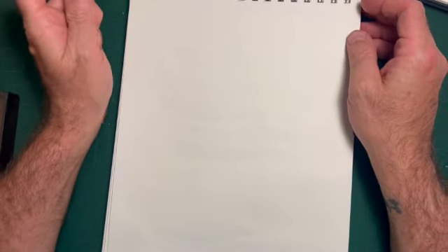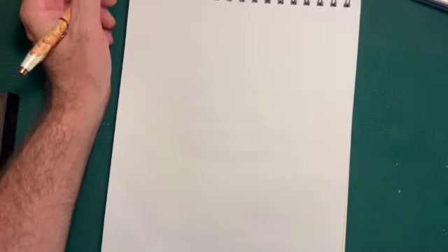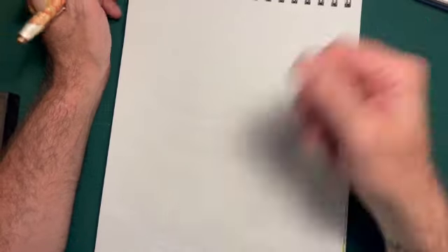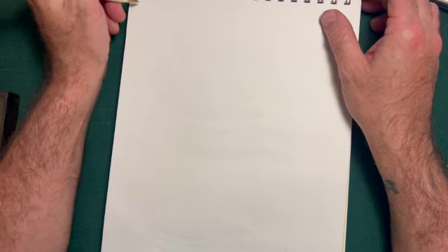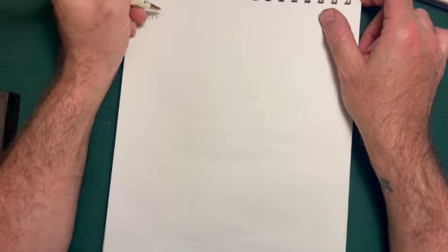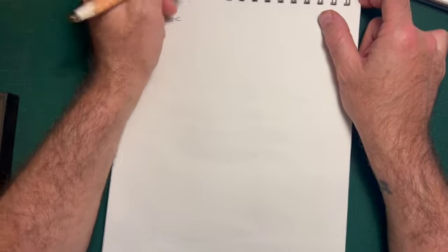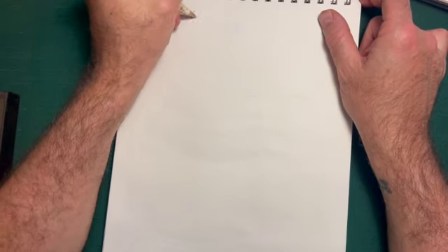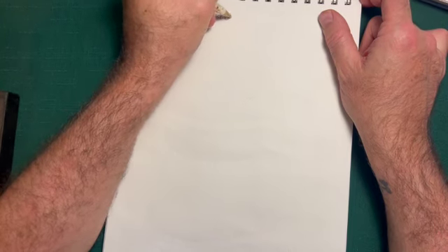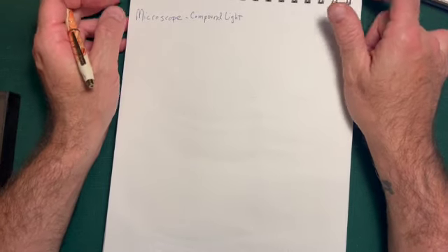Hello, Micronauts. I am here to draw for you once again. And I'm going to draw one of our weapons of choice in the quest for finding microbes, which is the microscope. And actually, what I'm going to draw for you is a compound light microscope.